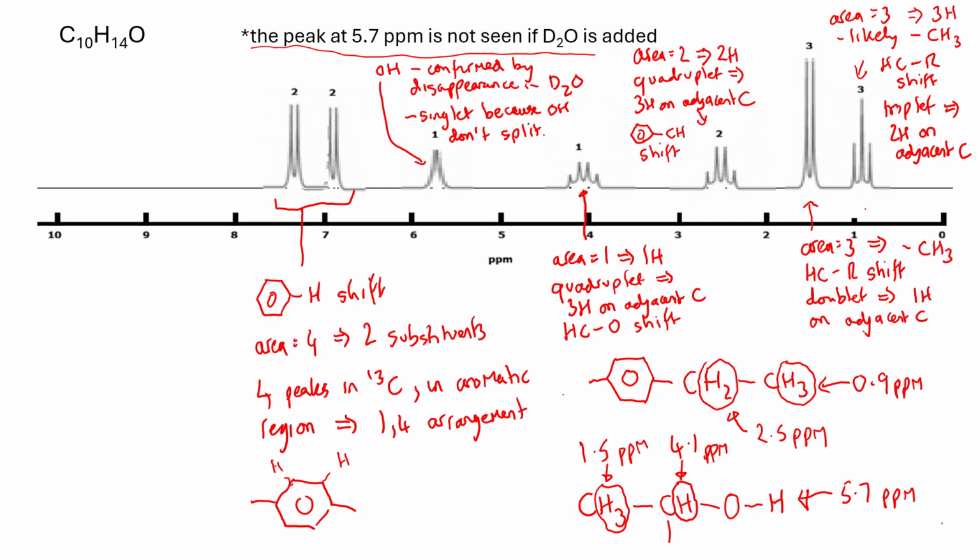One thing worth noticing is that this picture has got very busy with all these annotations on it, and you might feel uncomfortable having something quite as messy as that in an exam. So it becomes slightly problematic to know how you actually document all of this stuff. And one thing that's worth doing, which I haven't done here, but which we could have done, would be to just label each of these peaks.